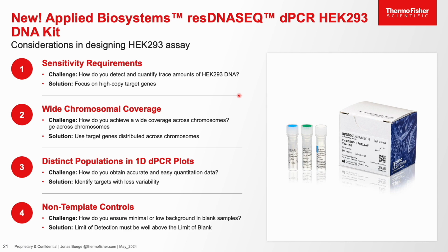First is the sensitivity requirements, where we have to focus on high copy target gene to detect and quantify trace amounts of HEK293 DNA. Secondly, we need to ensure that there is wide chromosomal coverage for HEK, so we have to use target genes that are distributed across the chromosomes to ensure broad coverage.